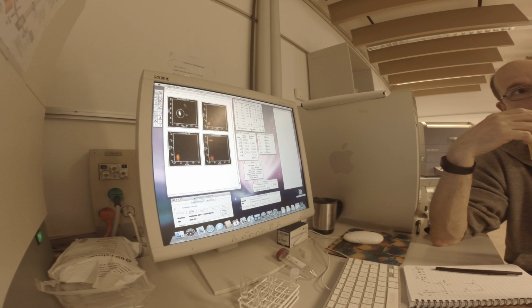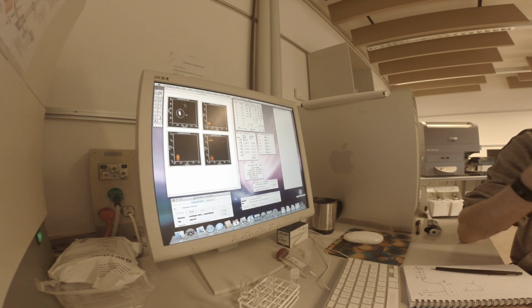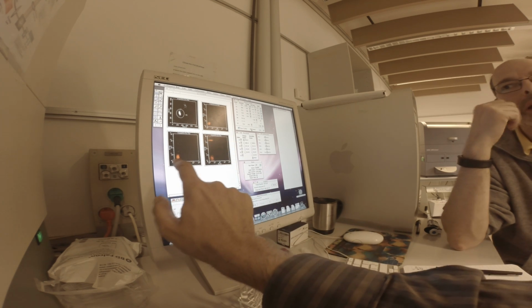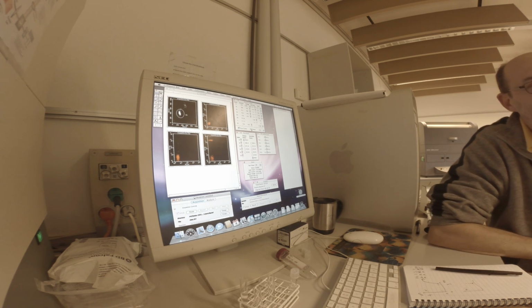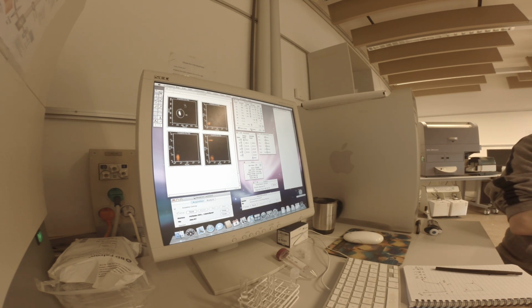Because it's a matter, as you said, of sensation. Exactly. And I have been sitting looking at this over and over again, so I believe this is the right one. It's very visual as well, when you look at this, how much you want to cut off down here. That is almost religion. People swear by their calibration system, and they absolutely have minute differences, and it doesn't make any difference for our experiment.